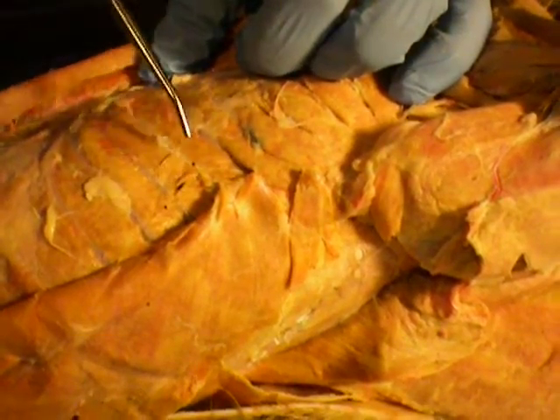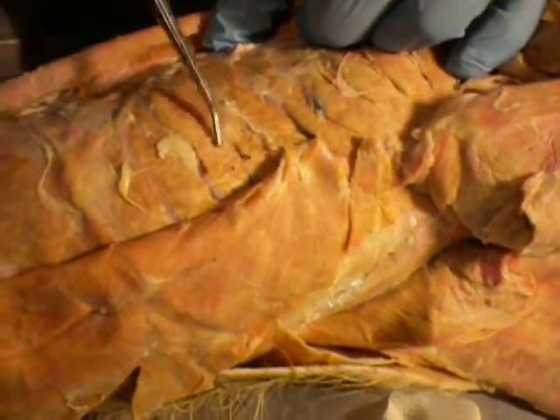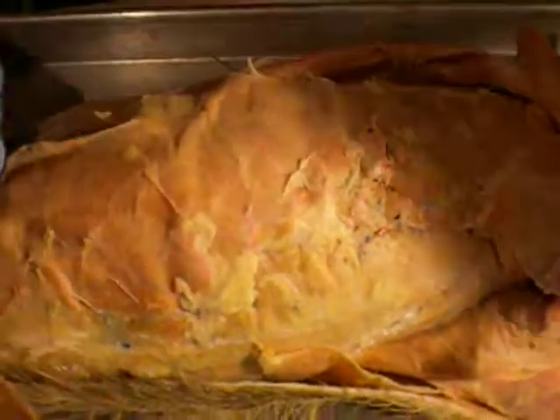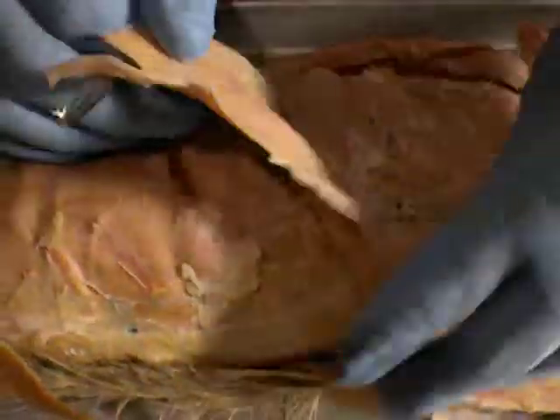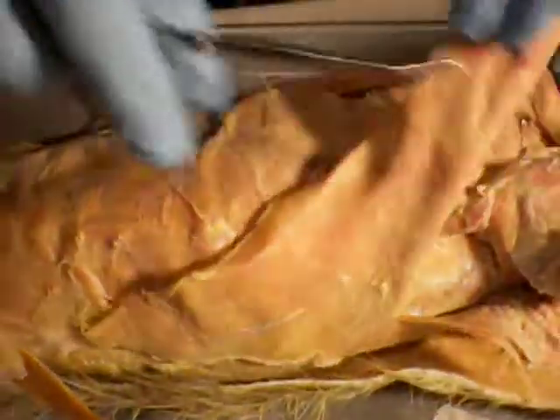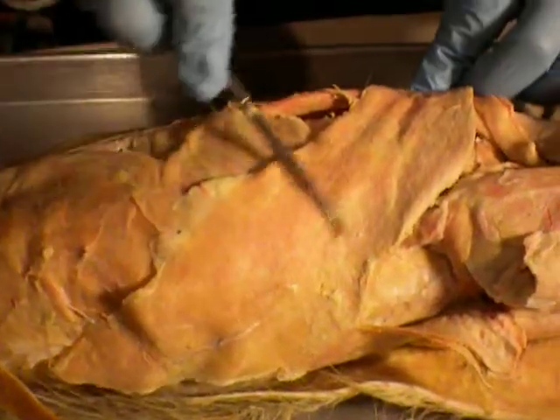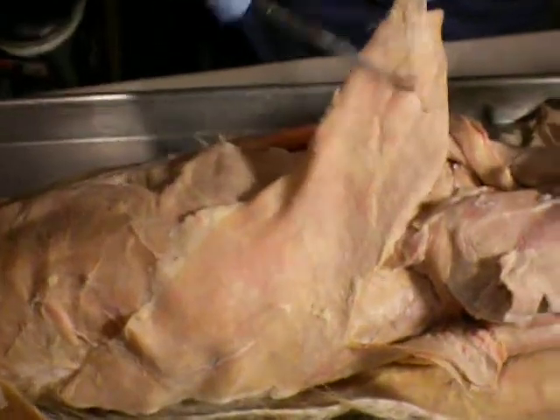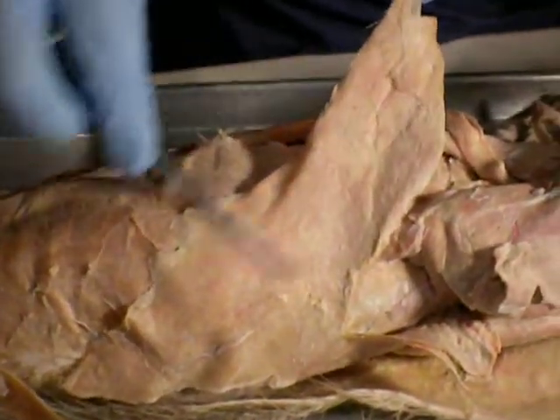The striations are different directions. You see the flap. This long muscle here that runs laterally is the latissimus dorsi, the big flap.